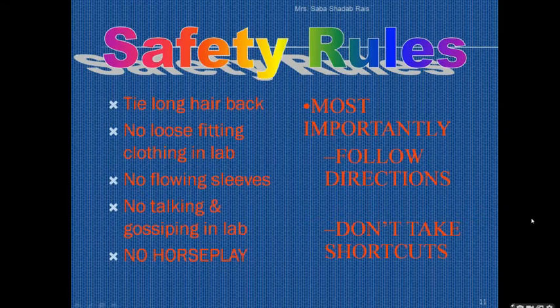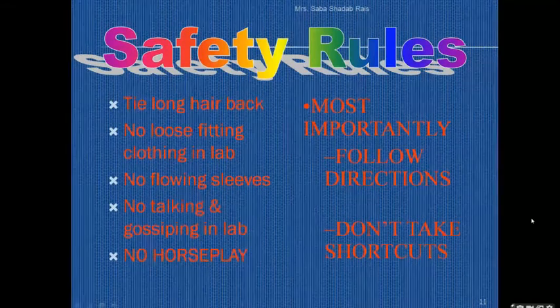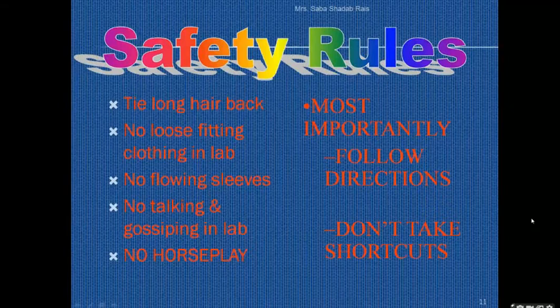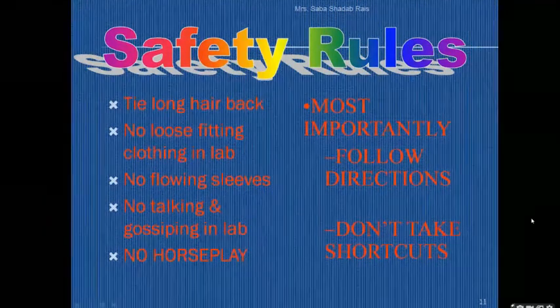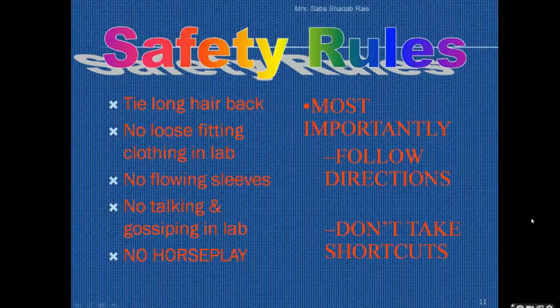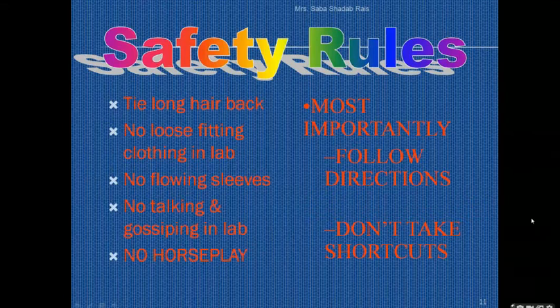Now why am I emphasizing this? First of all, I don't allow any girl to come with open hair into the laboratory, because if you do not tie it, it can catch fire. We have 5 tables in our laboratory, so if the student behind you is using fire, that fire can catch your long hair. So to avoid such accidents, it is very compulsory for you to tie your hair properly, or you can cover your hair. Most of the girls prefer to cover their hair to avoid any type of accident.